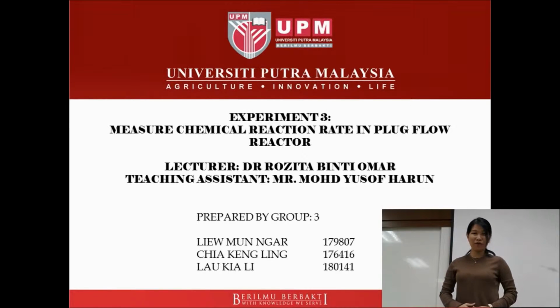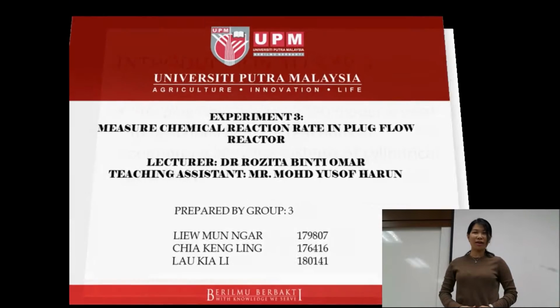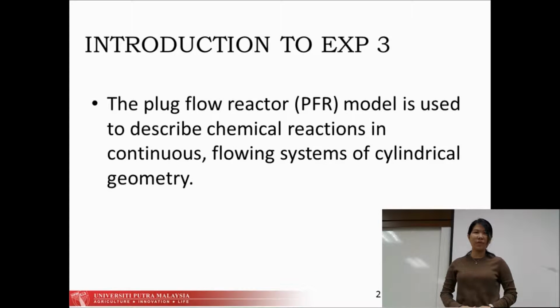Demonstration video about plug flow reactor experiment. Plug flow reactor model is used to describe chemical reactions in continuous flowing systems of cylindrical geometry.